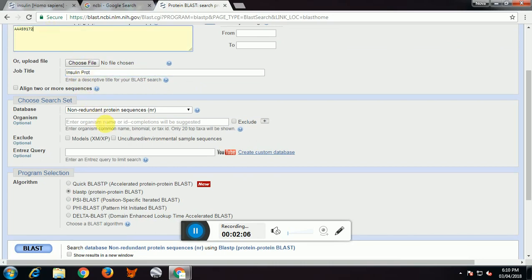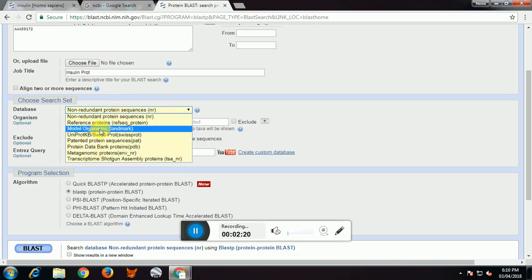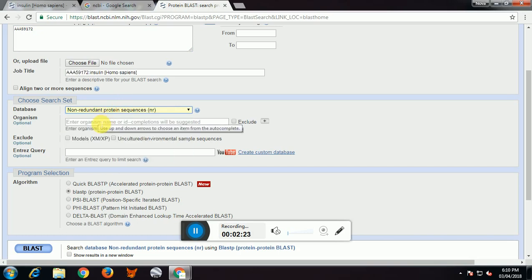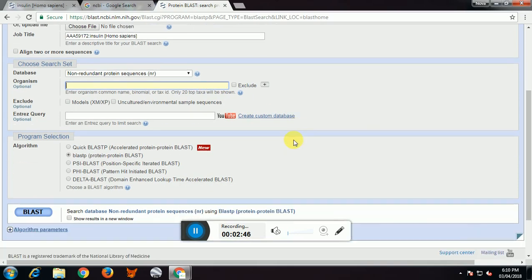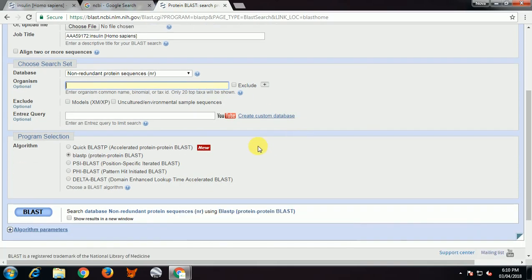I can also give a job title of my interest — I will type 'Homo sapiens' as the job title. The database I am going to choose is non-redundant. If we change any parameter from default, it will be highlighted in yellow. I can include or exclude an organism in my result. I will leave the organism field empty and not exclude Homo sapiens.